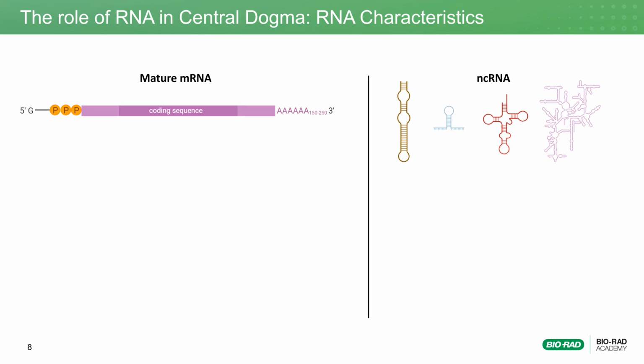To review and expand on some of the key characteristics of RNA biotypes, I've created a short list below to reveal some of the main similarities and differences between coding RNA, or mRNA, and non-coding RNA. Let's start by examining mRNA first.